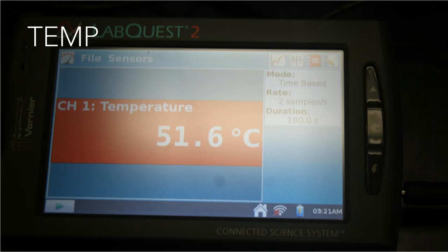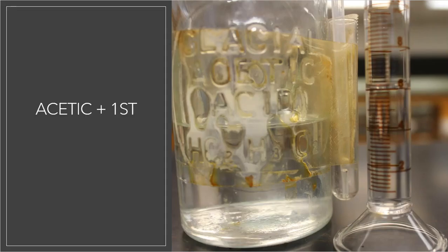Okay, so now I'm getting ready to prep everything in the glassware. The lab directions tell me go back to that glacial acetic and this time measure out around 6 milliliters of glacial acetic acid. So this is glacial acetic with no bromine in it at all, of course, right? No bromine. Just take the glacial acetic and add it to your transcinnamic acid. So here's my graduated cylinder. There's the 6 milliliter mark, and you can see the bottom of my meniscus that's right there. So I just slowly added it until I got up to the 6 mils.